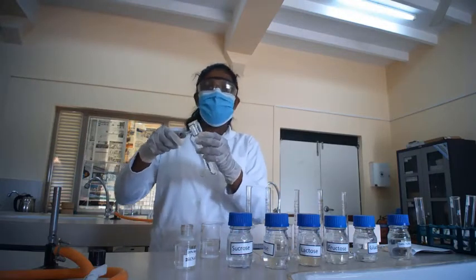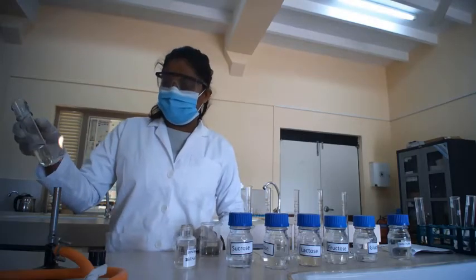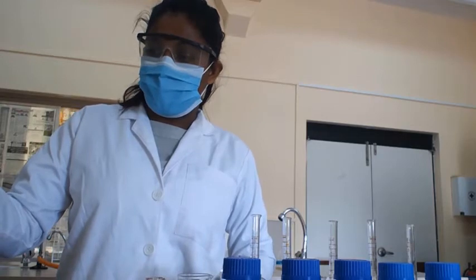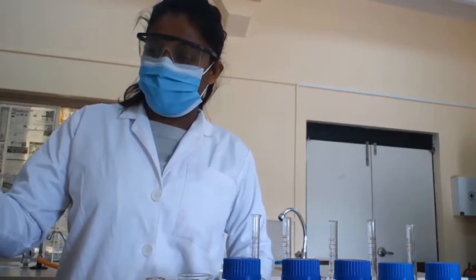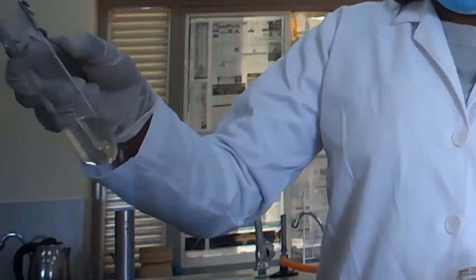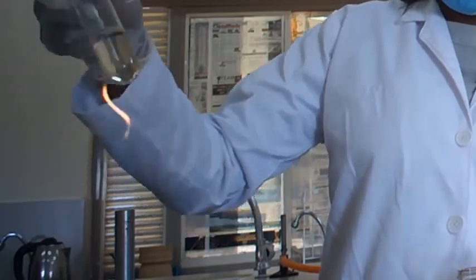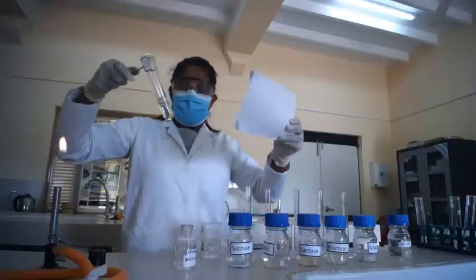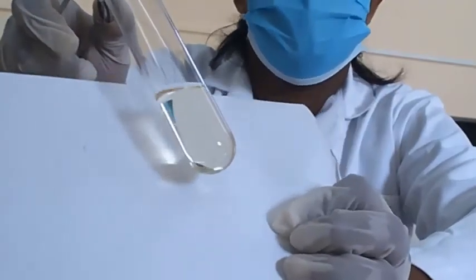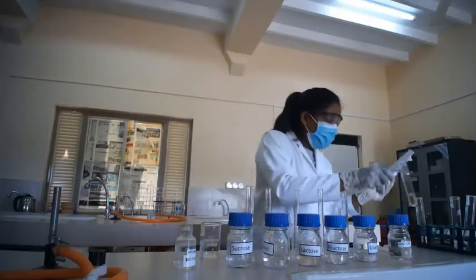Now you are going to boil the sugar solution and observe the color change. Now you can see the color change. The color has changed into yellowish color from colorless. Now we are going to let it cool down.